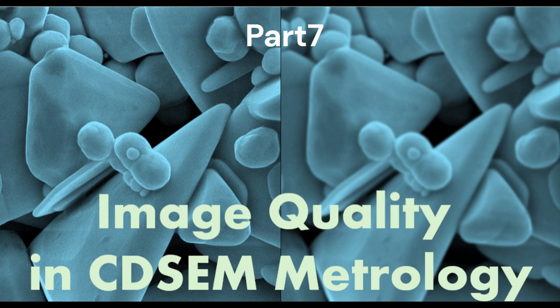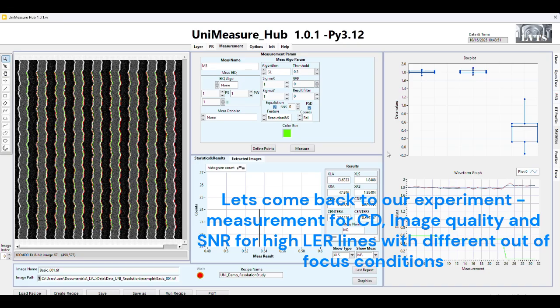Image quality in CD-SEM metrology, Part 7. Let's come back to our experiment.